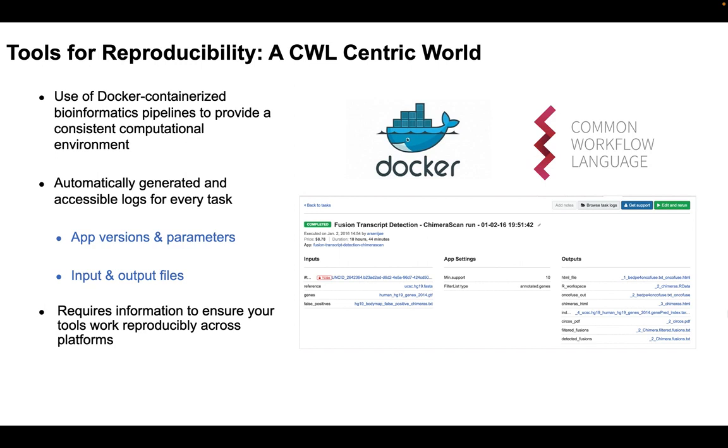So first I want to talk about some of the strengths of CWL for any who may not be aware. CWLs, or Common Workflow Languages, are Docker-contained bioinformatic pipelines that provide a consistent computational environment as well as automatically generates logs for every task which include the app version used, the parameters required, as well as the input and output files. It also requires additional information to make sure that the tool can work reproducibly across platforms and operating systems.